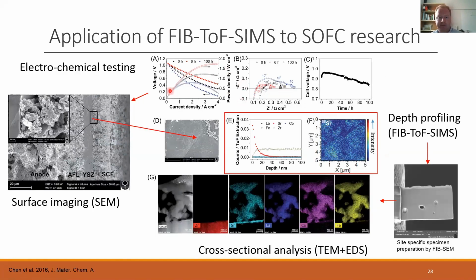and we can then combine that with a workflow which involves doing the electrochemical testing. So we do our conventional SEM analysis, identifying the region of interest.